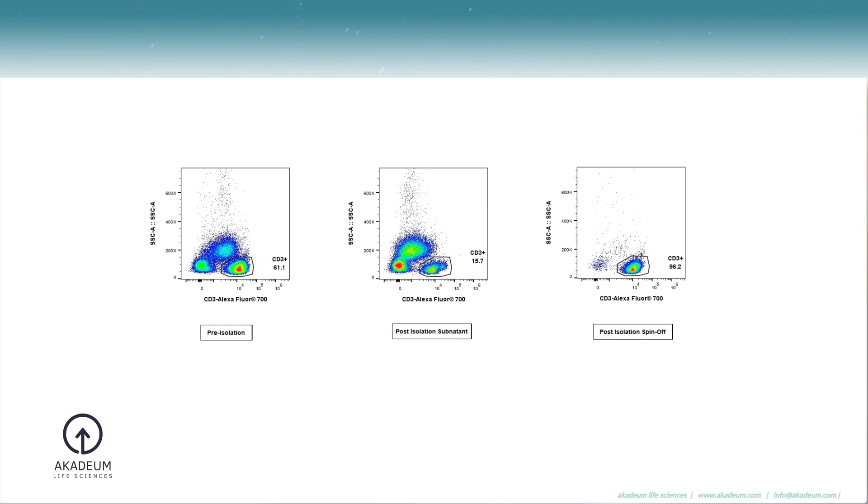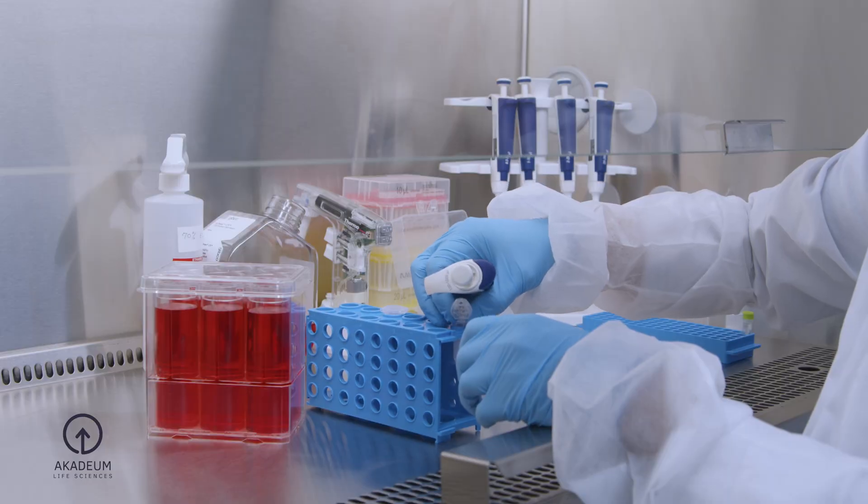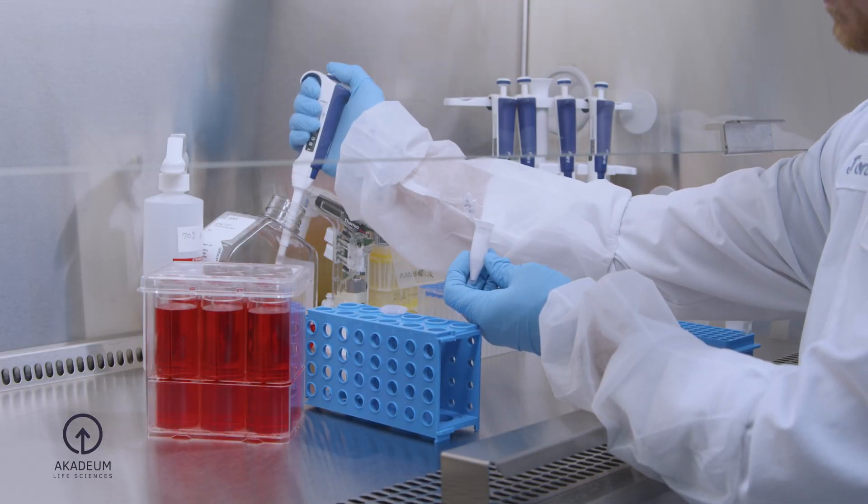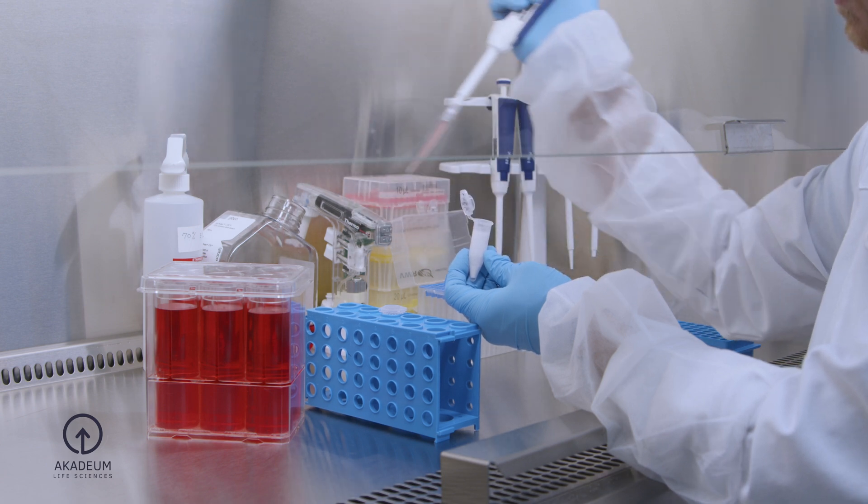Next, calculate the number of isolated T-cells captured using flow cytometry. Resuspend the microbubble-bound cells in complete media at 0.5 million T-cells per mil.